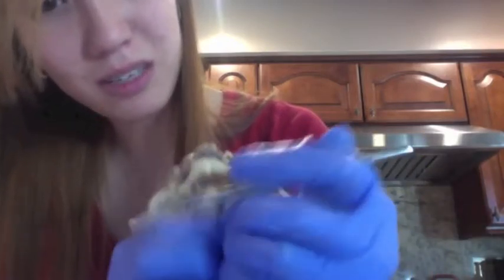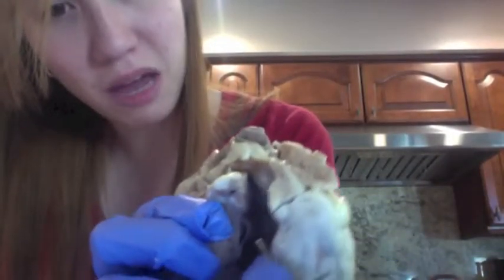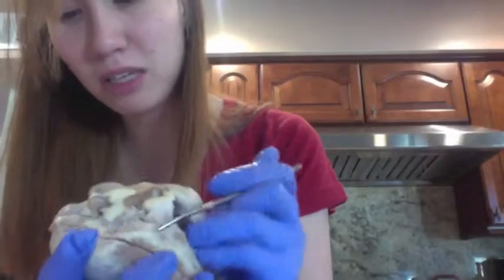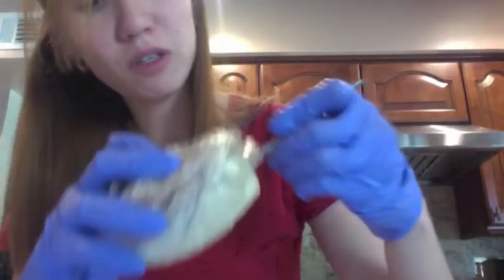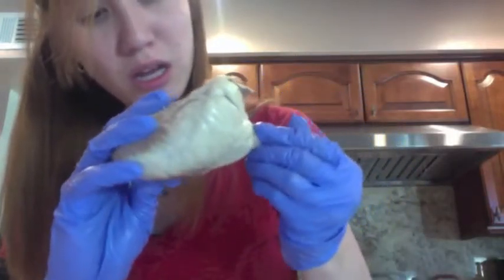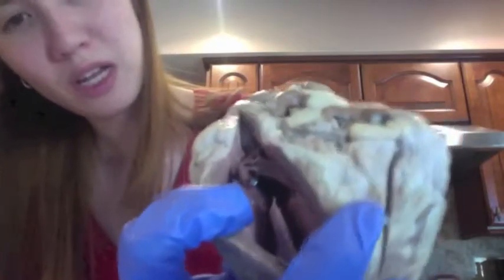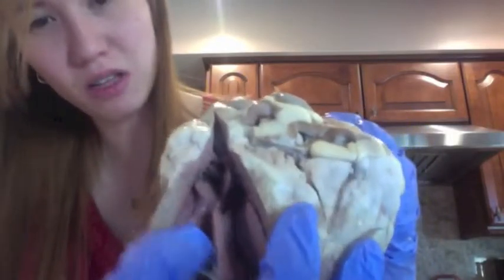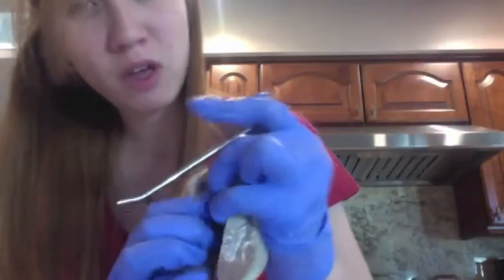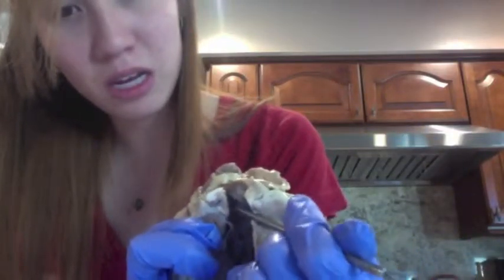And it might be easier in this one. If you can see, they're kind of in the back over there. We have the pulmonary semilunar valve, which is more noticeable when I do it this way. So going from this pulmonary trunk, and we come back out over here, the pulmonary semilunar valve would be located kind of up in here, a little out of the way from the way that I cut the heart open. And we have the aortic semilunar valve, which is up in here.